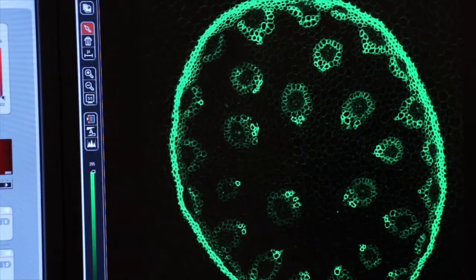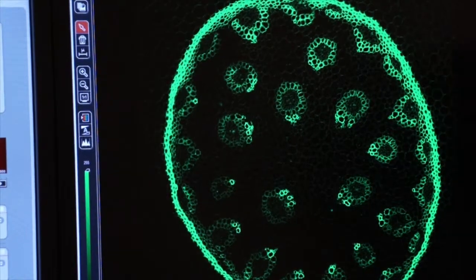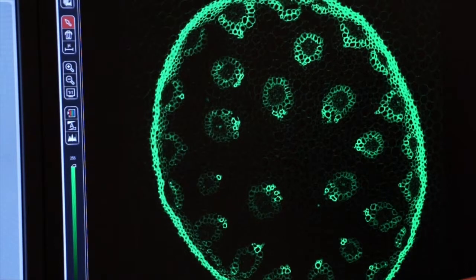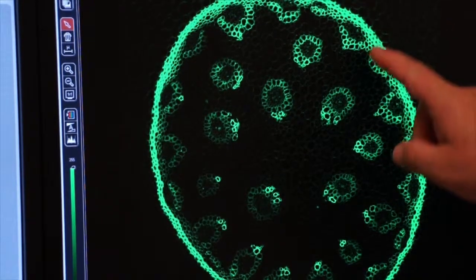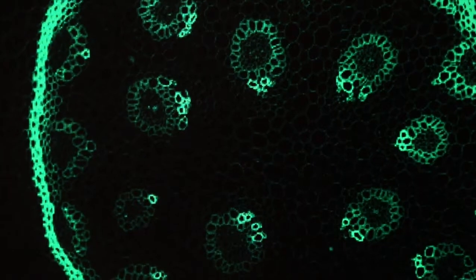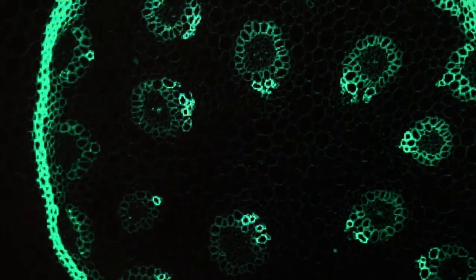Accumulation is useful, but it also does introduce some noise. You can see that it's still accumulating. The image is still being captured. And maybe if your eyes are sharp enough, you can watch the refresh scan go down through the image and now it's done capturing the image.